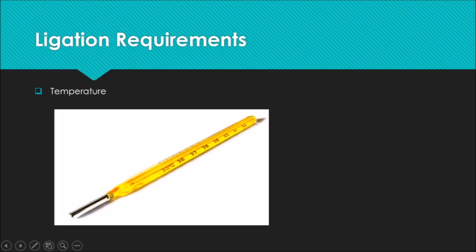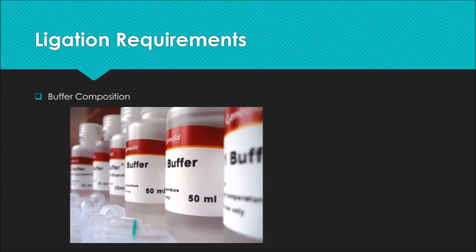The ionic strength of the buffer used can affect the ligation. The kinds of cations present can also influence the ligation reaction. For example, an excessive amount of sodium causes the DNA to become more rigid and increases the likelihood of intermolecular ligation. At high concentrations of monovalent cations, greater than 200 millimolar, ligation can also be almost completely inhibited. The standard buffer used for ligation is designed to minimize the ionic effect.